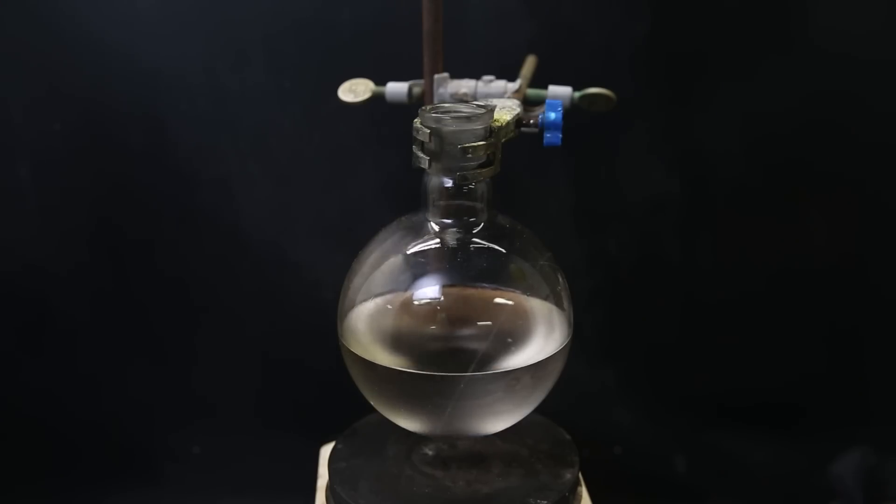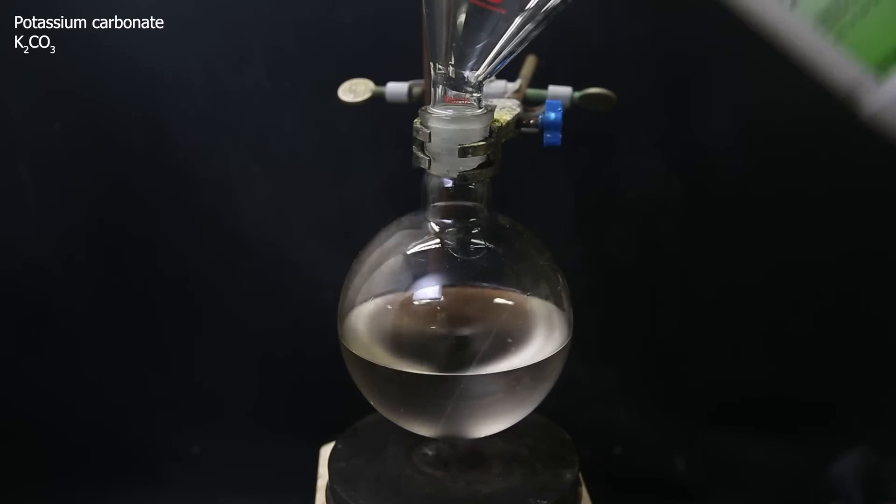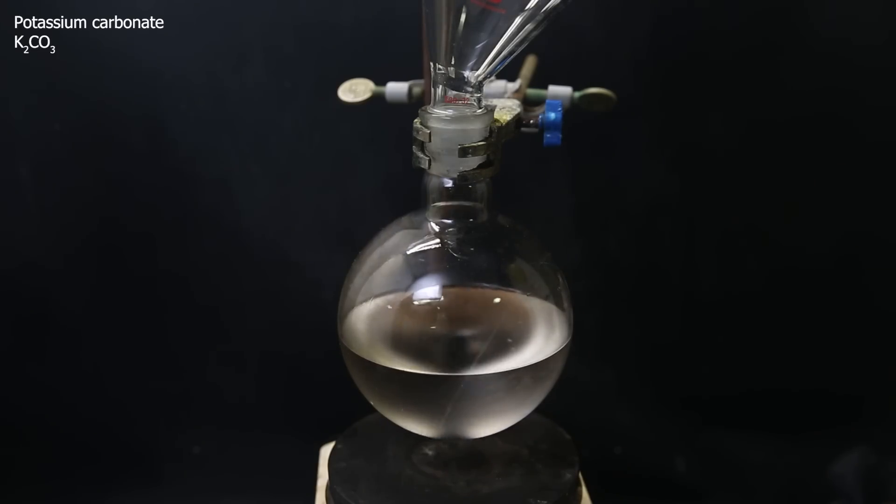Now coming back to the distillate, which is a mixture of water, 1,3-dioxalane, and some impurities. It is also completely saturated with sulfur dioxide. We can destroy the sulfur dioxide by adding potassium carbonate, and at the same time, it causes the water and 1,3-dioxalane to separate, because the water will dissolve the salts and kick out the dioxalane.